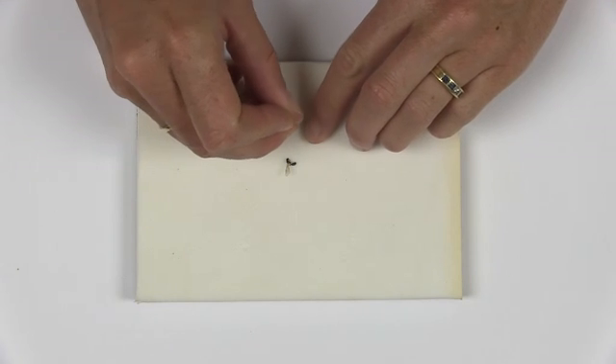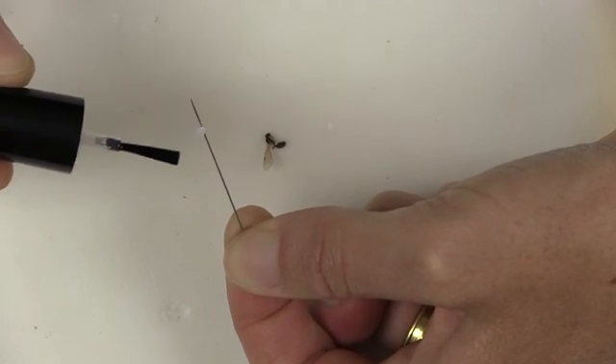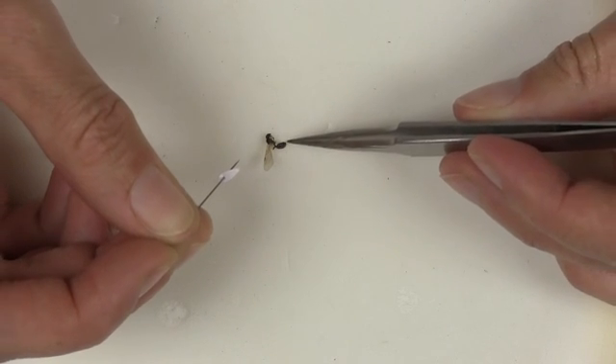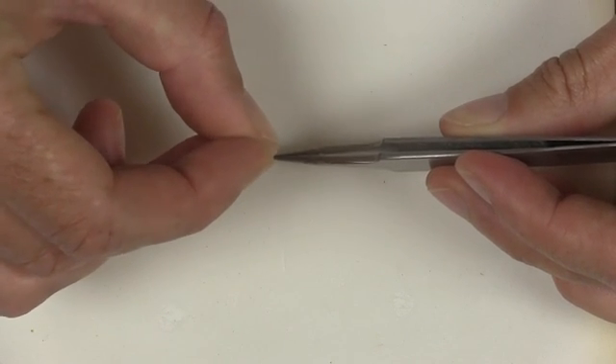Stick the paper point on the pin at its wide end. Leave the paper point near the bottom of the pin and put a drop of nail polish on the bottom tip of the point. Position your insect upside down from how you would like it to be positioned in the end. Then carefully stick the pin with the paper point next to the insect so that the insect will stick to the nail polish.